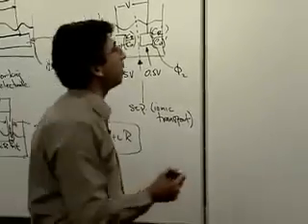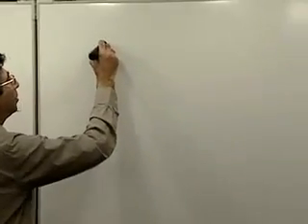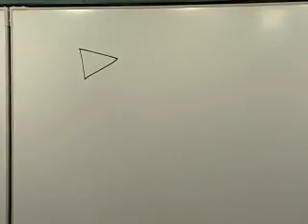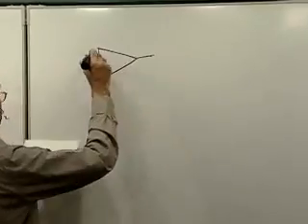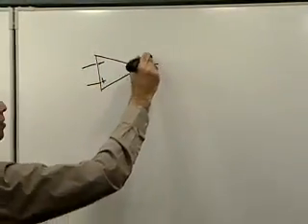Now, op-amps are symbolized by these triangles. And we have 3 wires coming out of an op-amp: 2 inputs, a plus and a minus input, and an output. That's the output.